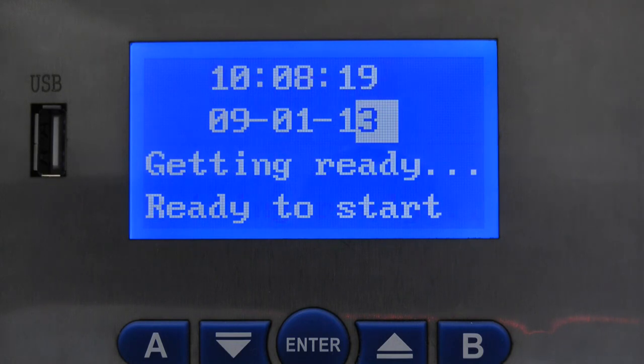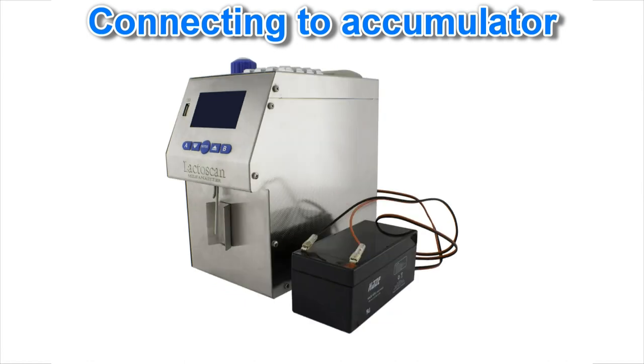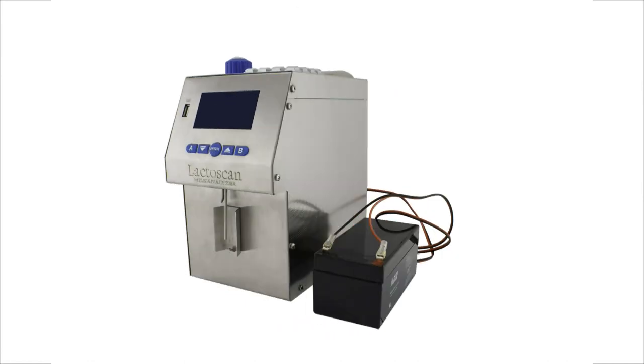A sound signal is heard when the analyzer is ready for work. The analyzer can be connected to a car battery or powered by an accumulator.